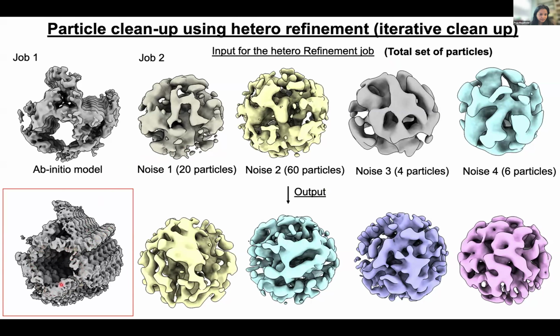And this is the zoomed view. While we can see that there are small filament fragments present on the grid, the filament network was completely absent. Then we performed our functional studies with these interfilament association-breaking mutants, and we find that more than 80 to 90% activity of this system was abolished, suggesting this filament network enhances the activity of this defense system.